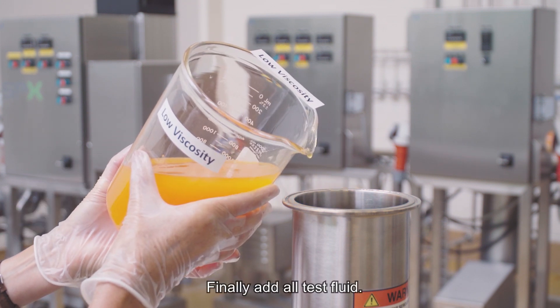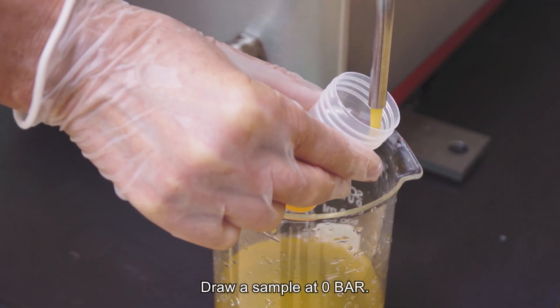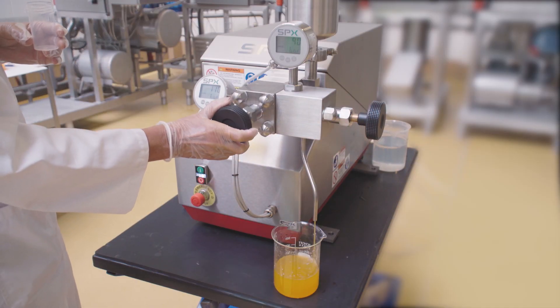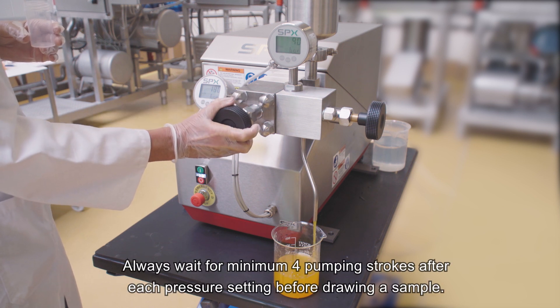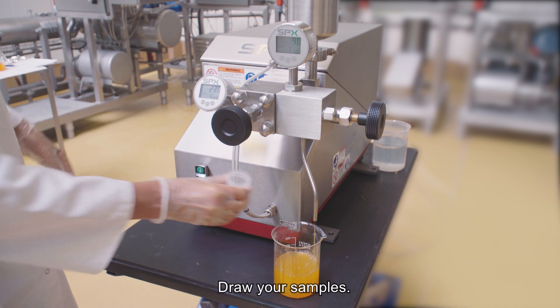Finally, add all test fluid. Draw a sample at zero bar. First apply pressure on second stage and then on first stage. Always wait for a minimum of four pumping strokes after each pressure setting before drawing a sample. Then draw your samples.